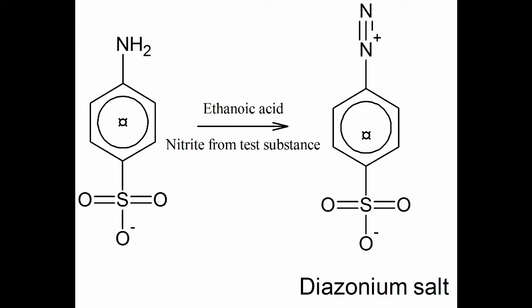The first step of the reaction is conducted with the sulfonylac acid. This is dissolved into glacial acetic acid. A few drops of the resulting solution are added to the liquid that has to be tested for the presence of nitrite ions. If nitrite ions are present, the reaction you see here takes place.